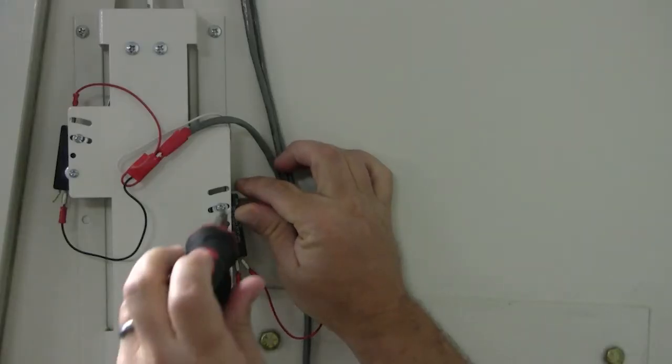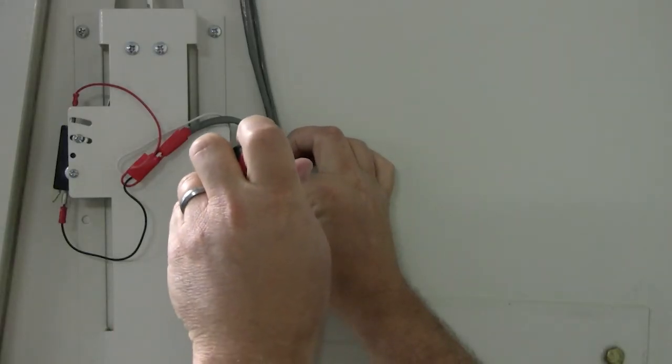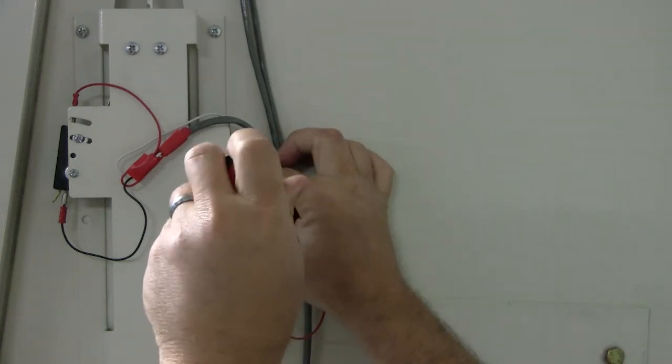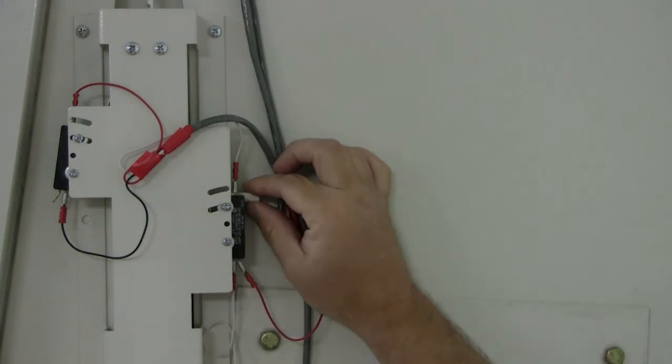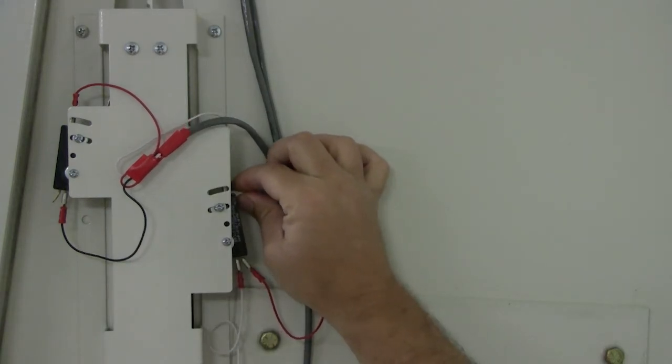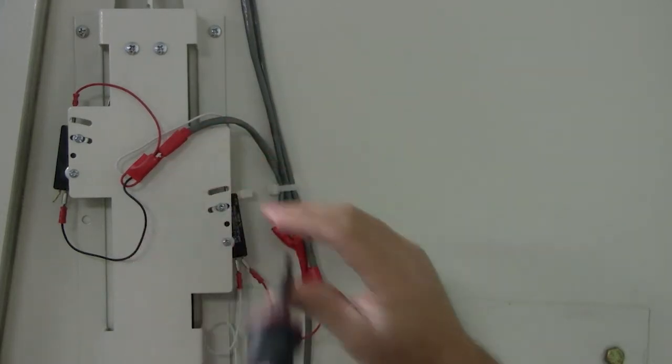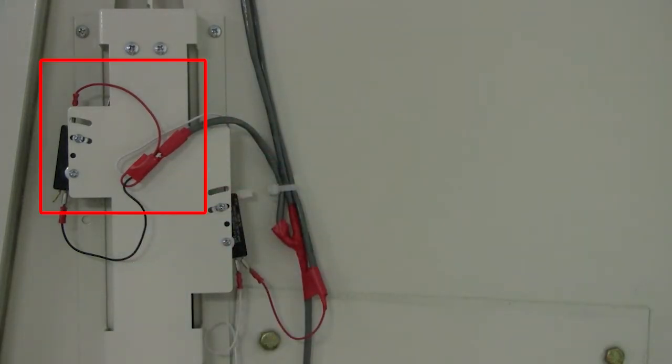Follow the same procedure to adjust any of the three micro switches. After adjustment has been made, make sure to secure the micro switch by re-tightening the upper Phillips head screw and check all wires connecting to the switch. Here you see the roller arm being activated as the sash is closed.